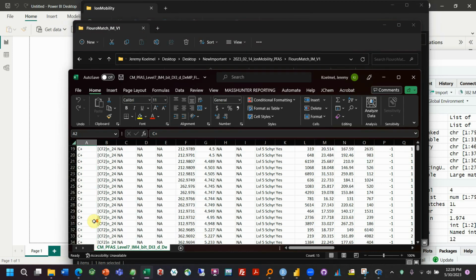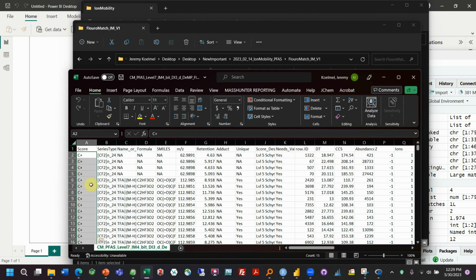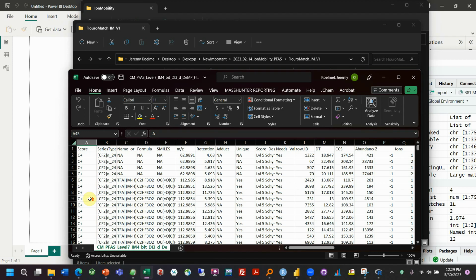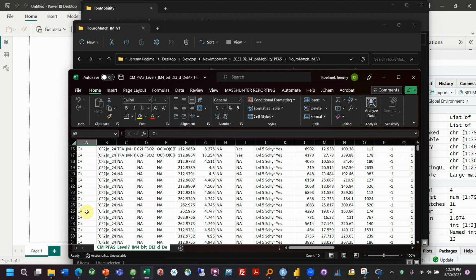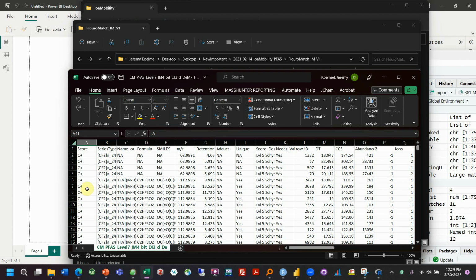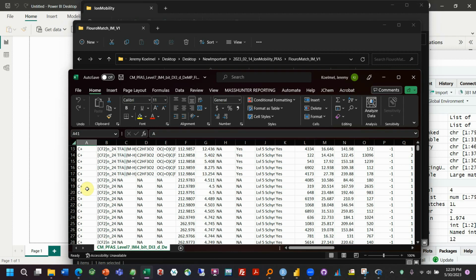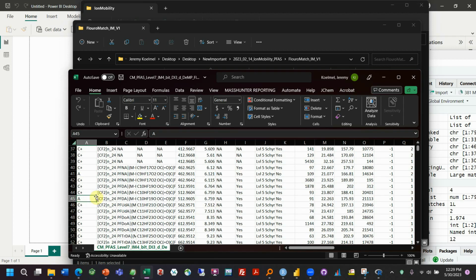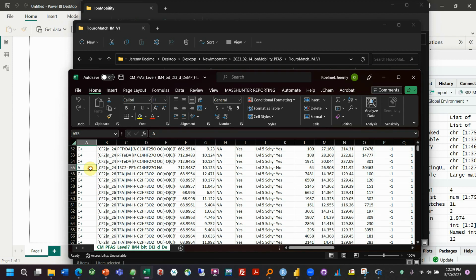There's scores, which are defined very well in the manual, but C+ is things that form a series with something assigned an A. And A's are things with collision cross-section based identification. So these are other members of a series with those high confident hits. A lot of these might be false positives, other masses that would match that formula that would fall in the series but don't have the retention time and drift time. So we'll want to use the visualizer to confirm these species.